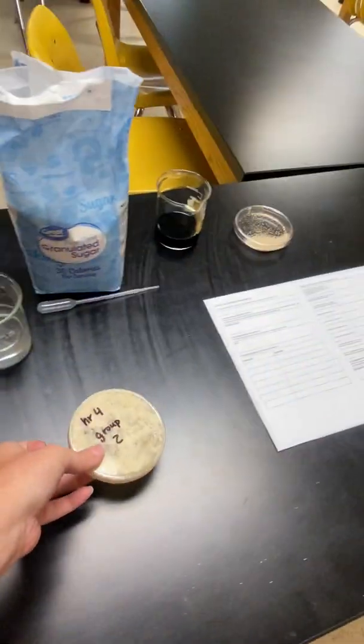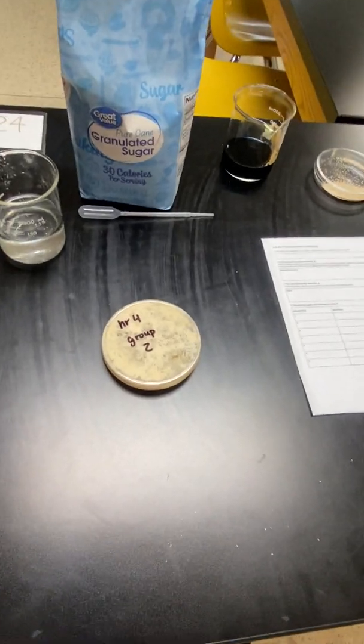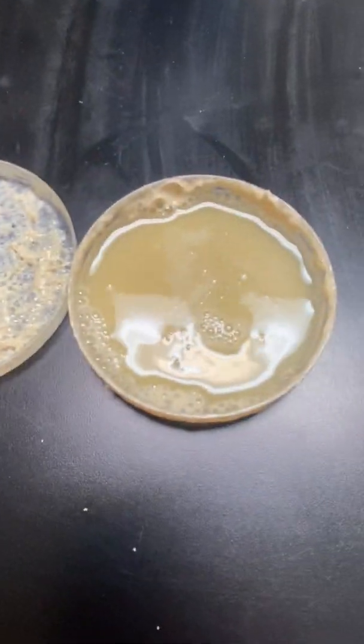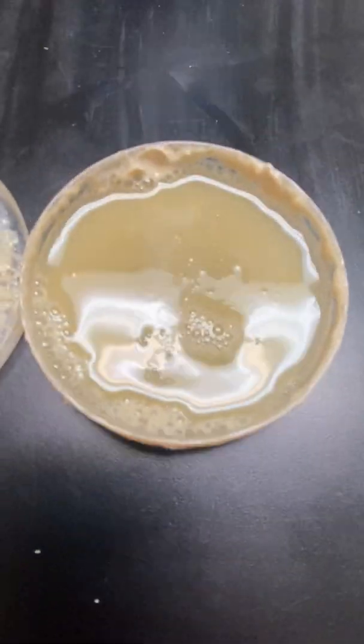And here are the results after 24 hours. So you're going to make some observations of what it looks like. Look at that. That's after 24 hours. So something happened. So record your observations of what it looks like.